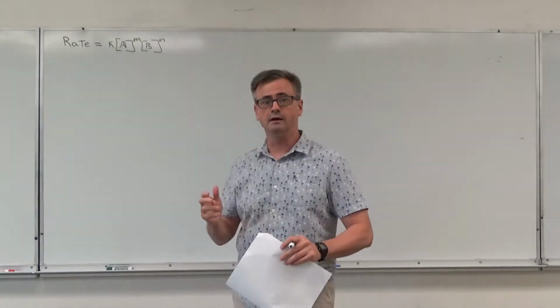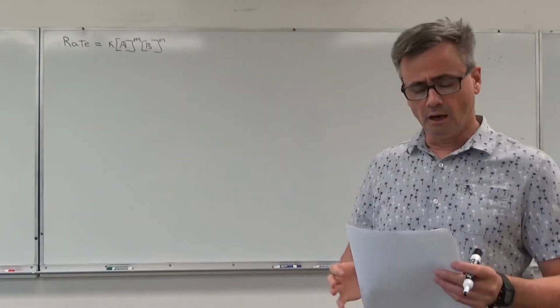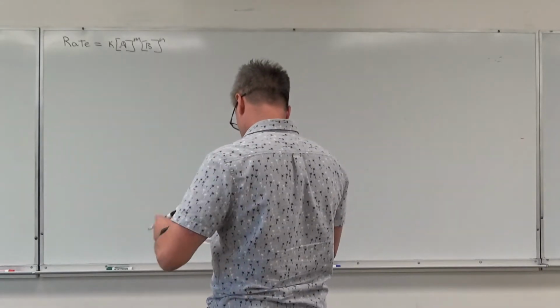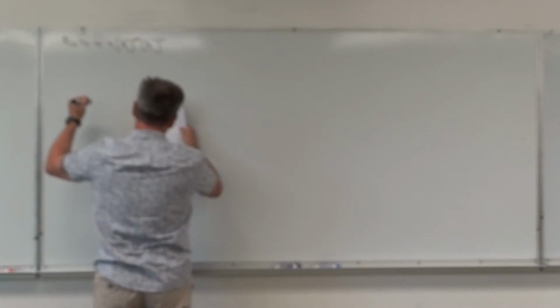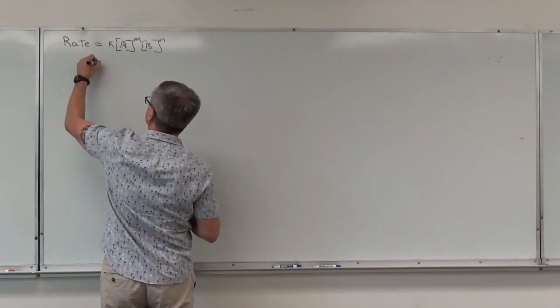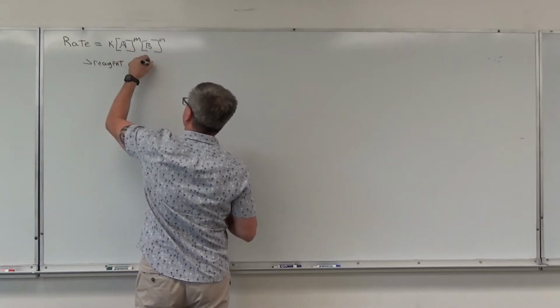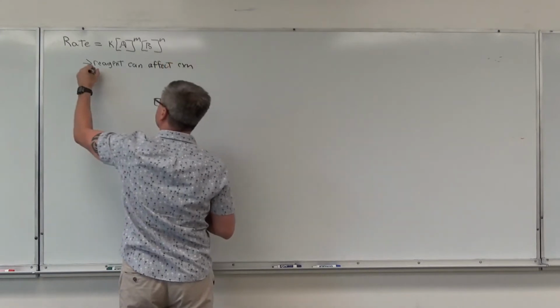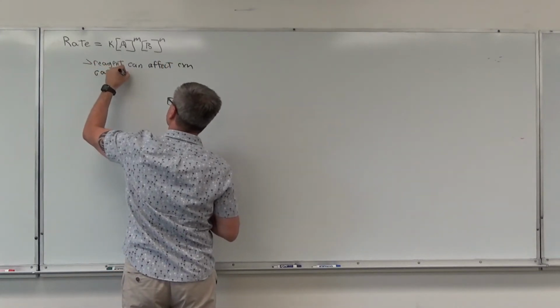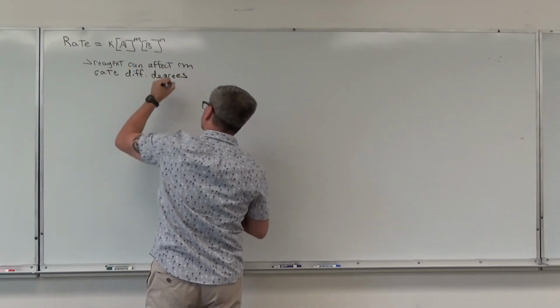I rewrote the general rate law on the board and put some notes on what I was talking about, doubling and what it does to the rate. I already said this, but reagents can affect reaction rate to different degrees.